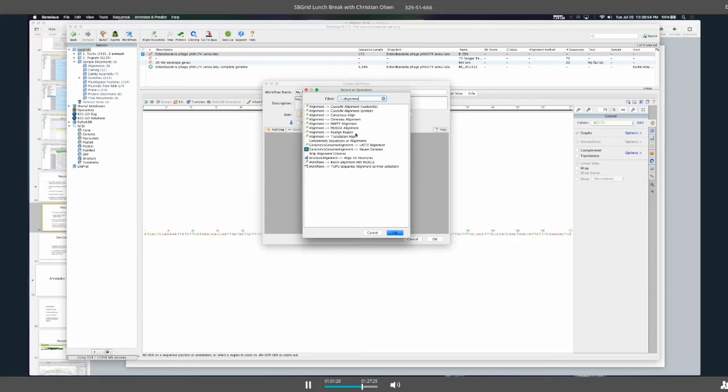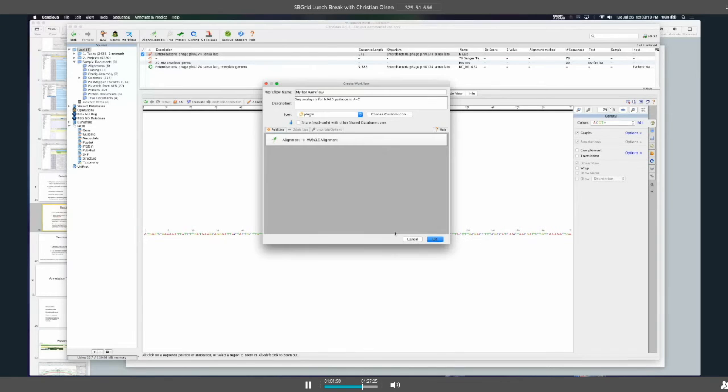So if I want to do a live search on all of the alignment steps that I could use in my workflow, I just type in alignment in the live search field, and it pulls up all of the alignment steps. Okay, so nucleotide, protein, NGS reads, 3D structures, it doesn't matter. It's all the same type of thing you want to do. It's an alignment process. Okay, so in this case, I'll choose to run a muscle alignment. Okay, so it adds that step to my workflow canvas.